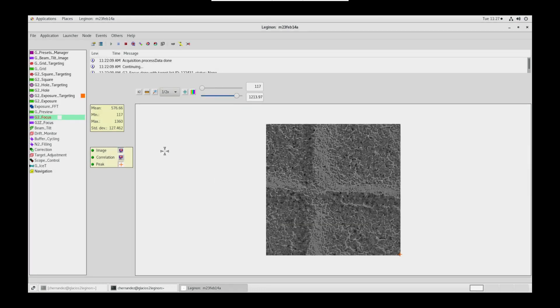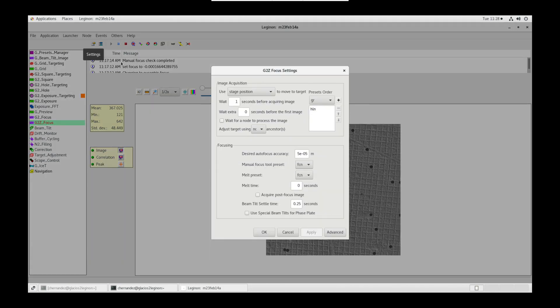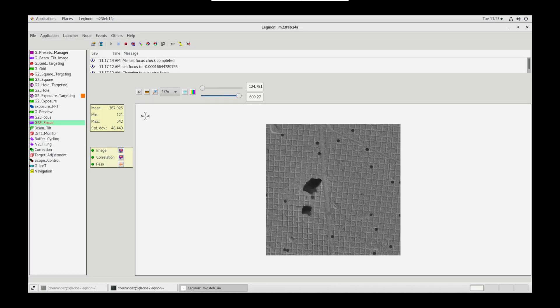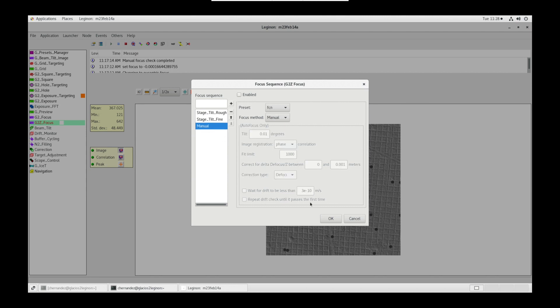Now let's go to Z focus node. In settings, wait for a node is unchecked. Preset is HLN. And desired autofocus accuracy is 5E to the negative 5 meters. In focus sequence, stage tilt rough preset is square LM. Fine tilt is HLN. And manual is FCN.